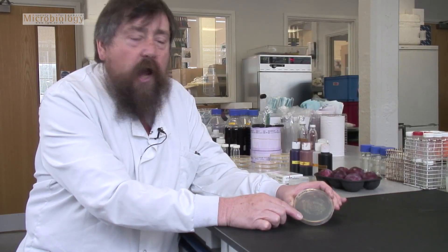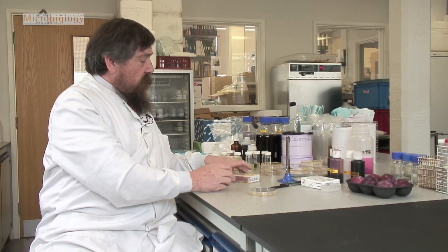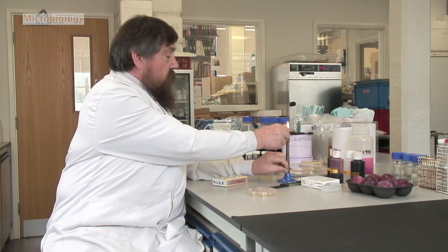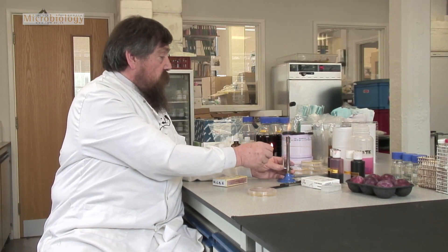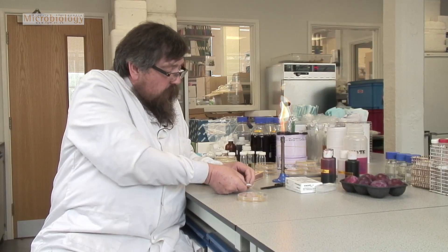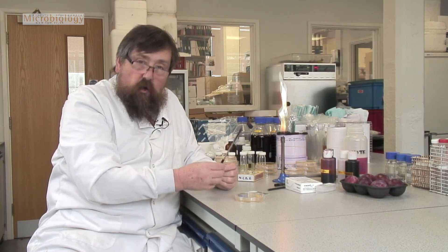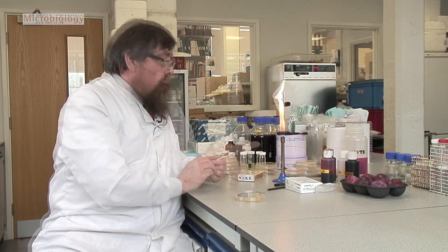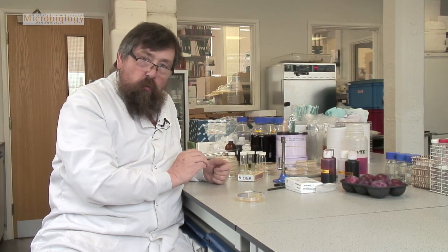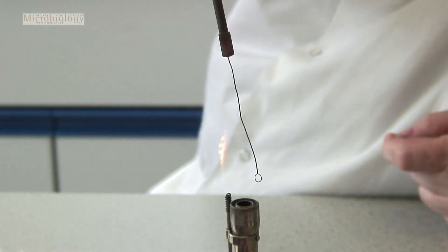To really check, I need to make a slide and look at those cells underneath the microscope. I'm going to light the Bunsen burner because we're going to do some microbiology work. I've got my microscope slide here, and I've got my yeast cells there. I'm going to take a small colony with what is called an inoculating loop. I need to sterilize this loop, so I turn my Bunsen to give a nice roar and I hold the loop in the flame to get the wire red hot.